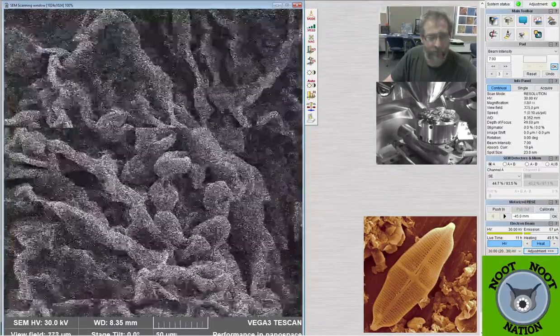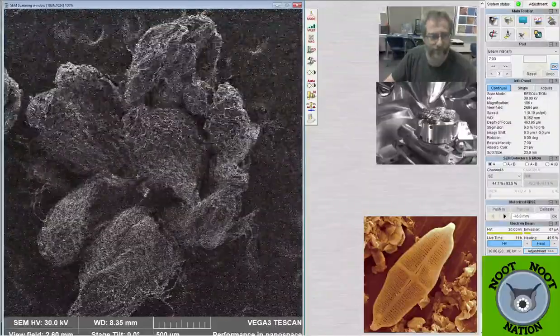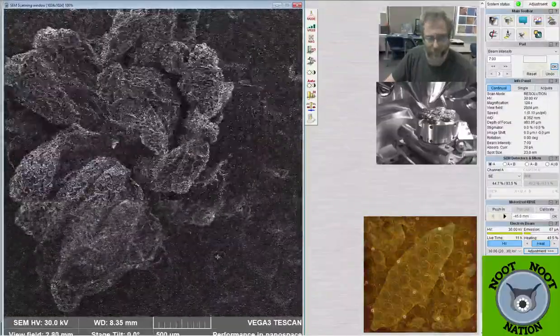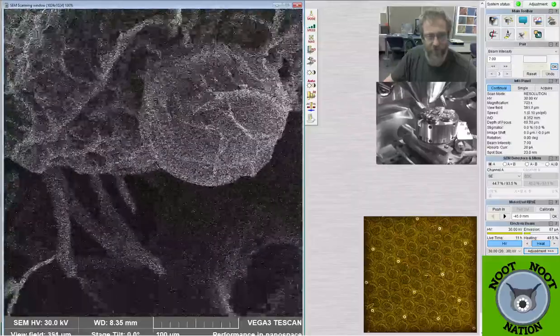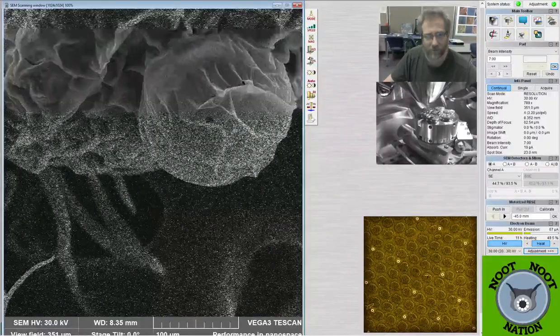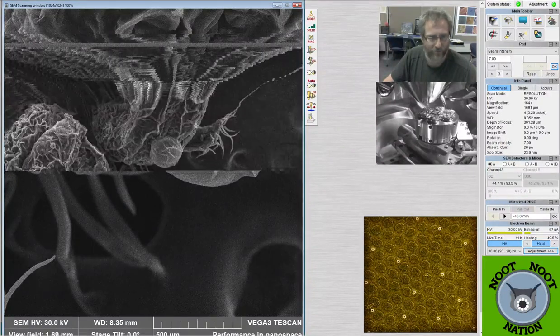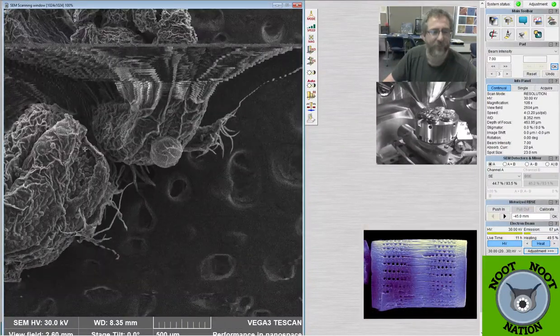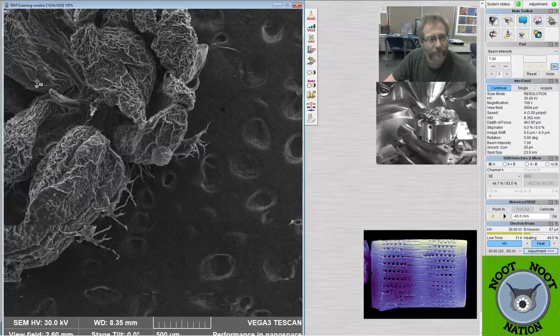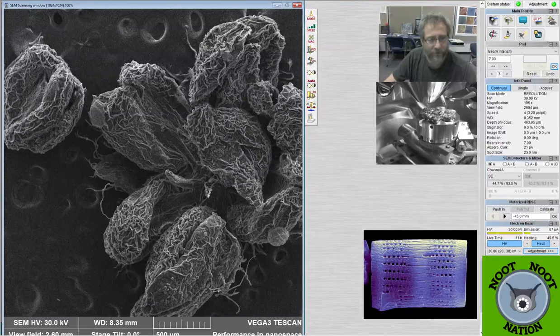Okay, I have one more stub full of stuff. I guess unless we want to have some picture where I look at one of these weird things. I'm not sure what this blob is, actually. Some part of the plant that I smushed. Yeah, I don't think these are super interesting. They just look like raisins.